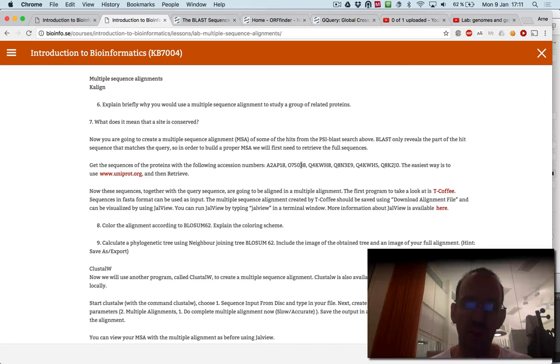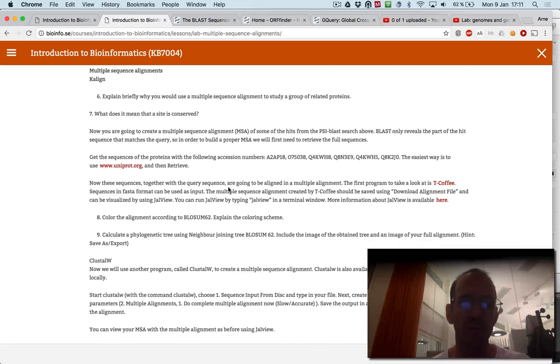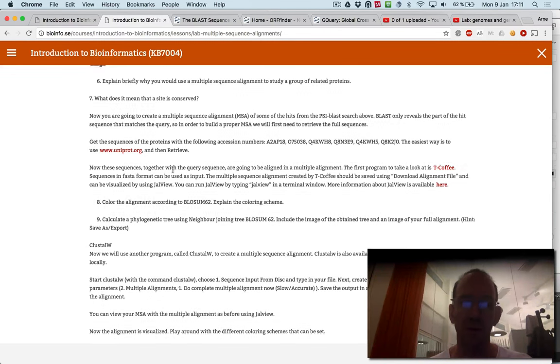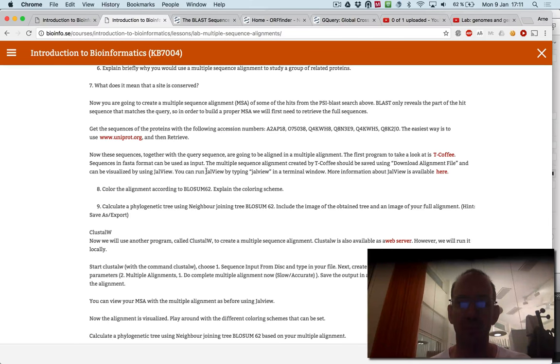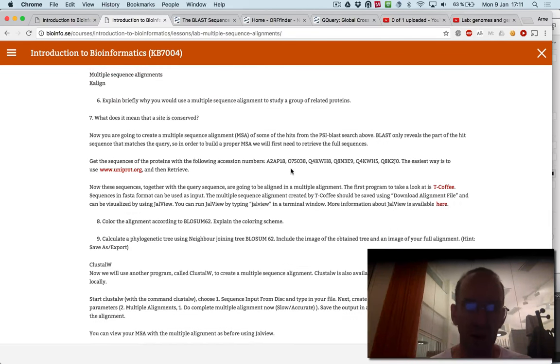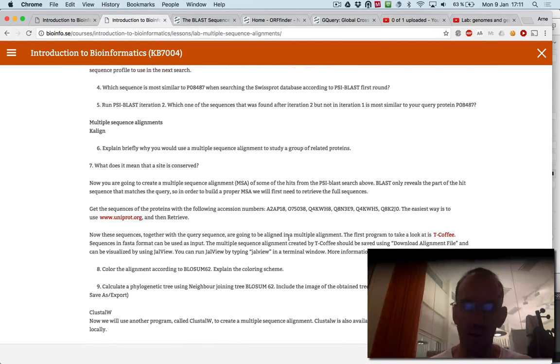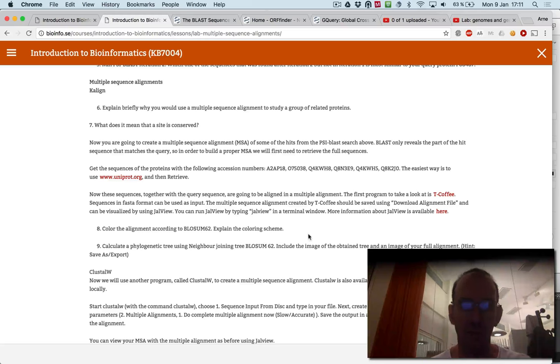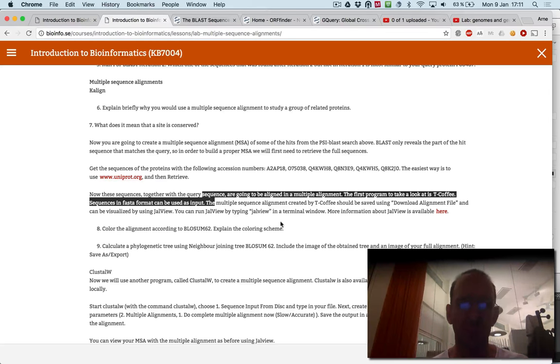You can use K-align and T-coffee, which is a different program. You should look at this alignment using a program called Jalview.